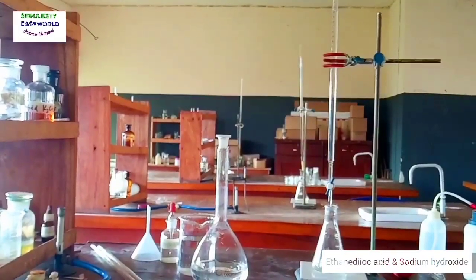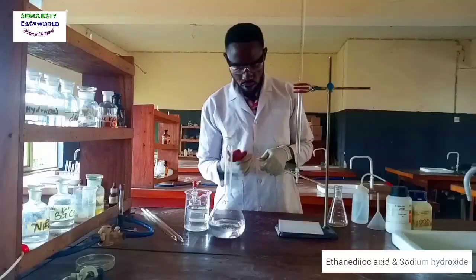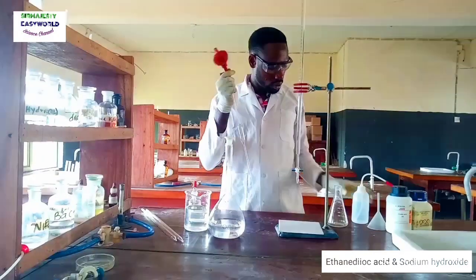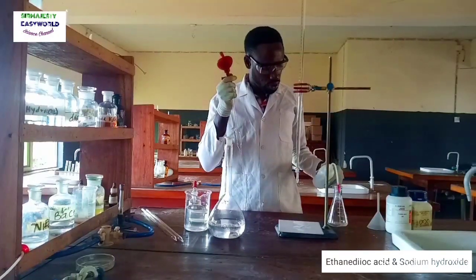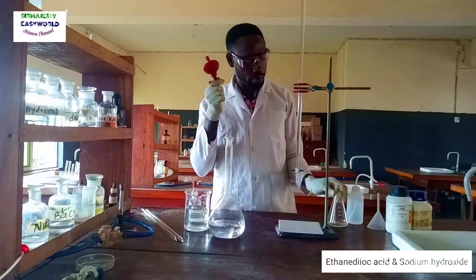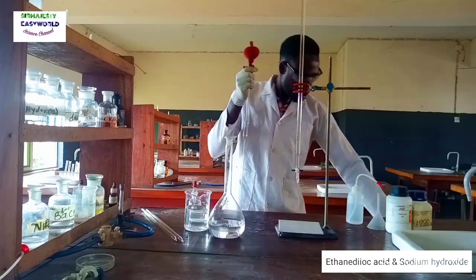Let me run the titration again. For the second titre, remember to wash the conical flask or the Erlenmeyer flask with distilled water.